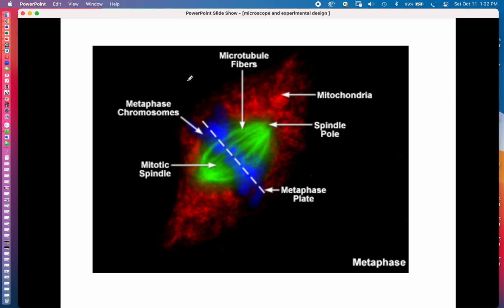The pigments in the stains in this sample, in the way the specimen has been prepared, can absorb that light and they can't hold on to it. So they're constantly letting go of the light, and they've held on to it for a short time, and so they'll release light that's at a lower energy, and a lower energy would be a longer wavelength.